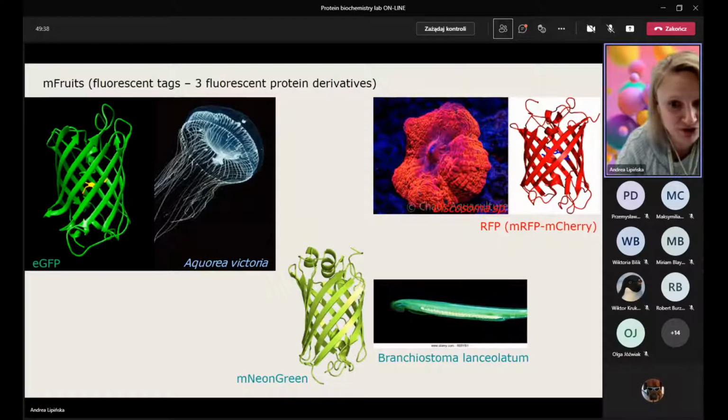Usually, GFP traps are using so-called llama bodies. So, have you heard about llama bodies? The antibodies actually come from alpaca and not from llama, but they are very similar. So what are nanobodies, or let's say alpaca antibodies? What are the specific features of those immunoglobulins? Anything that comes into your mind?